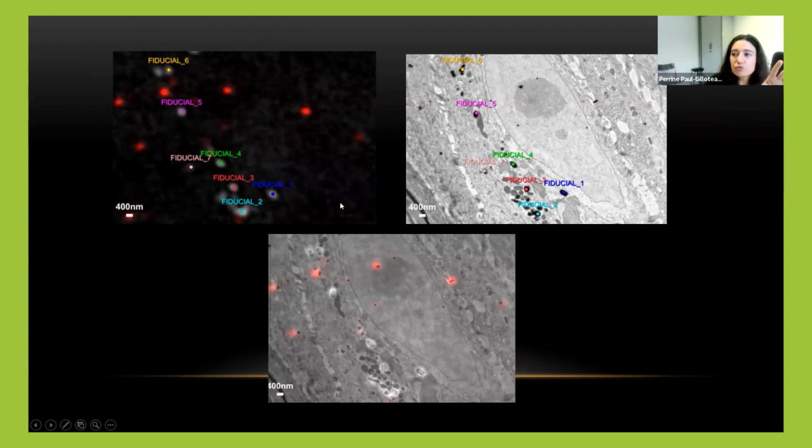Just here to look at the error and everything, I'm going to use these melanosomes to do the registration, and just look at what's happening in the bits to assess the error. And as you can see, there is some error after the registration. And once again, this is maybe due to some sample deformation, but also maybe due to the fact that I'm very bad in placing my points because melanosomes are kind of big here.